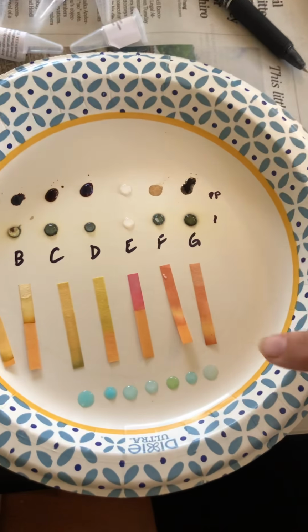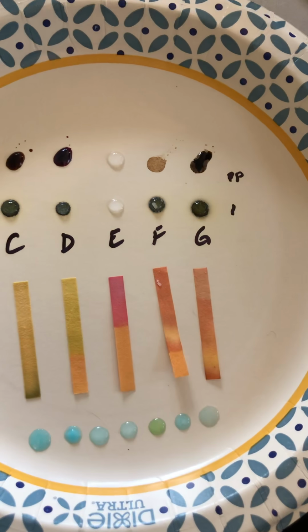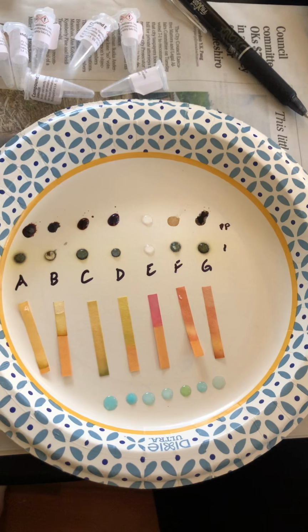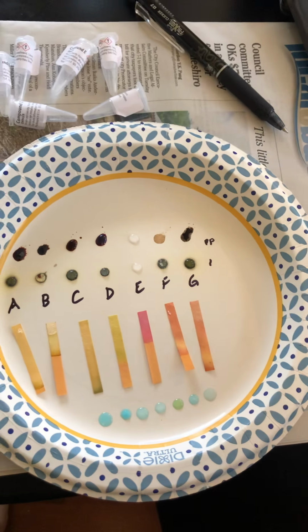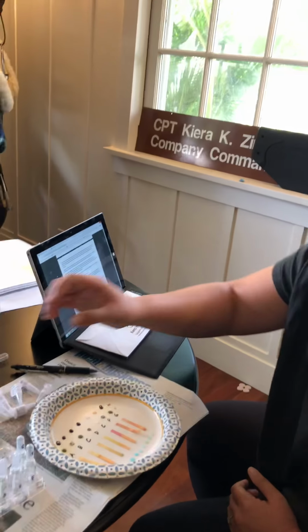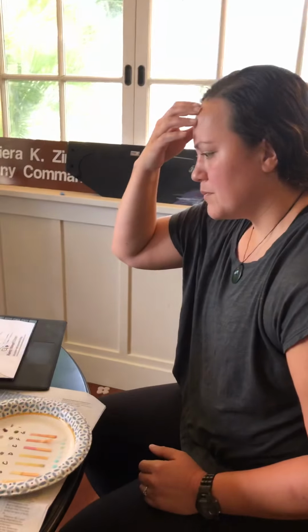Okay. I noticed also from the pH paper that it's an acid. So, and there's 3 acids listed. Because it's got a low pH. Looking at the results on the pH paper, it's a low pH, so it's acidic. So after doing a little work to see which one is the antioxidant, we went with ascorbic acid.